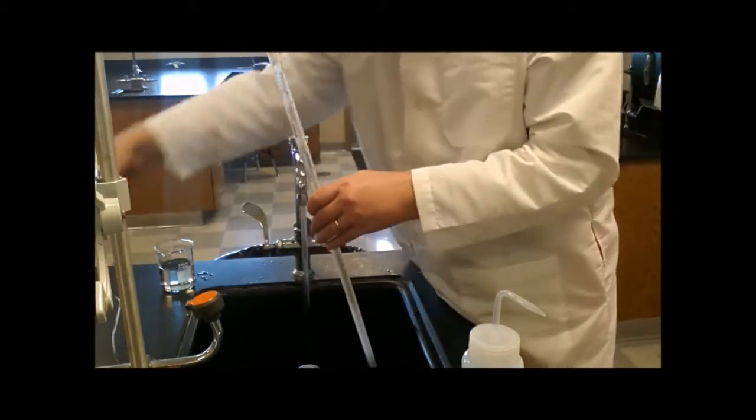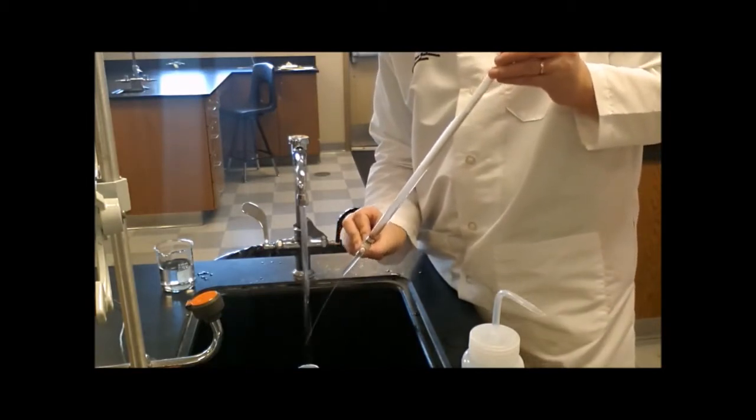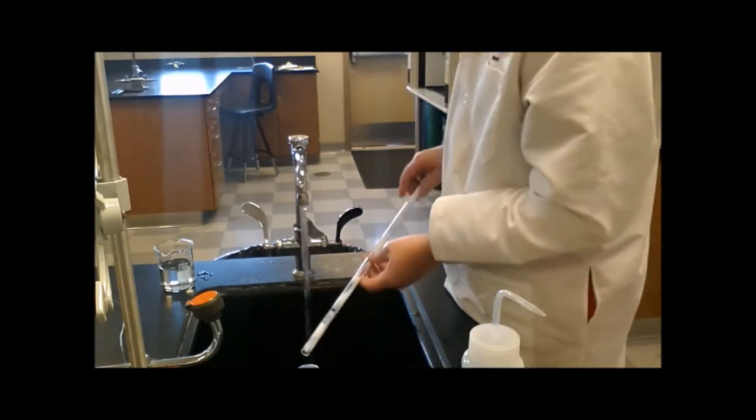Here's the problem that everybody has at this point. How do you get the soap out? So I'm gonna rinse out the bottom too. I'm gonna let some of my soapy water out the bottom through the stopcock, clean out the stopcock. Then how do you get it out? Well, okay, you can dump it out.